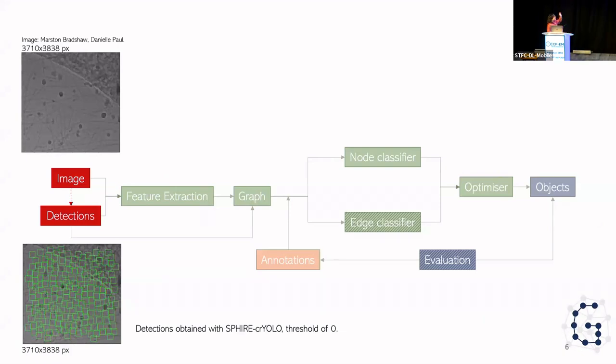This is the whole thing. But we have this very big image, right? This is almost 4,000 by 4,000 pixels. And can we reduce how big this data set is into actually more usable things?